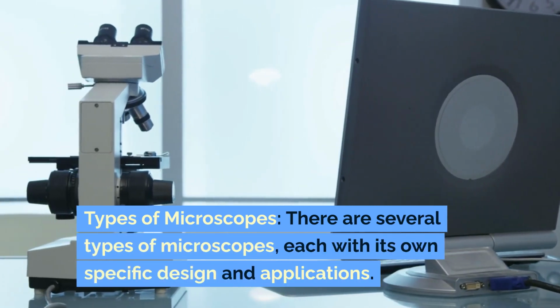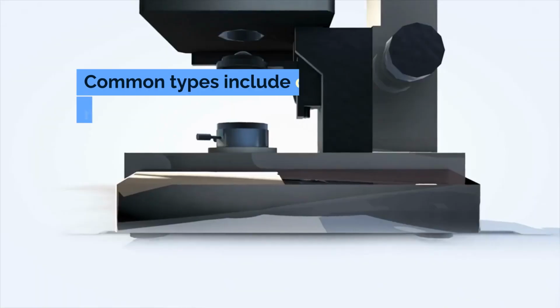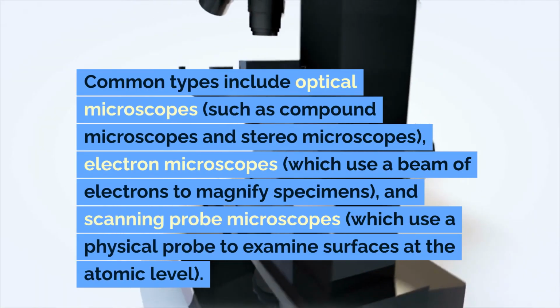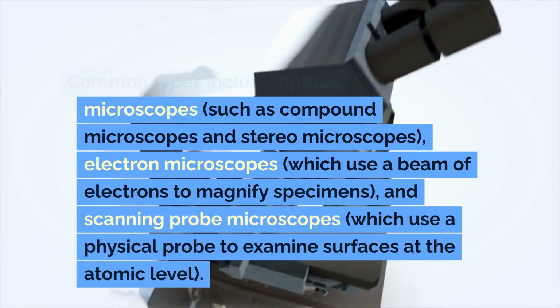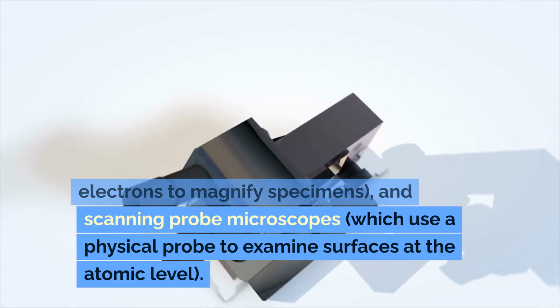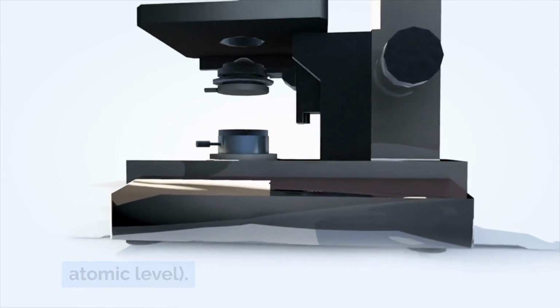Types of microscopes. There are several types of microscopes, each with its own specific design and applications. Common types include optical microscopes, such as compound microscopes and stereo microscopes, electron microscopes, which use a beam of electrons to magnify specimens, and scanning probe microscopes, which use a physical probe to examine surfaces at the atomic level.